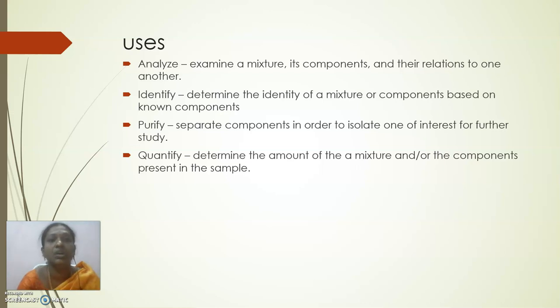Next is to identify: the separation helps in identifying the mixture or components based on the known components. So after the separation, we can easily identify the compounds which are present in the sample.